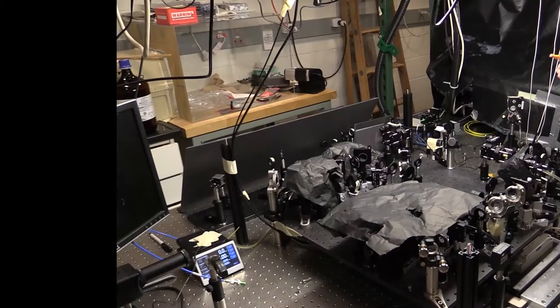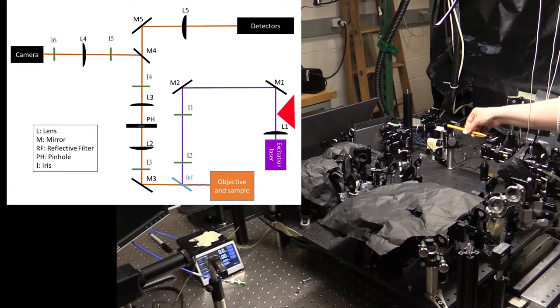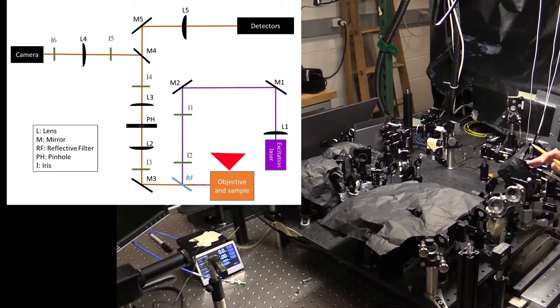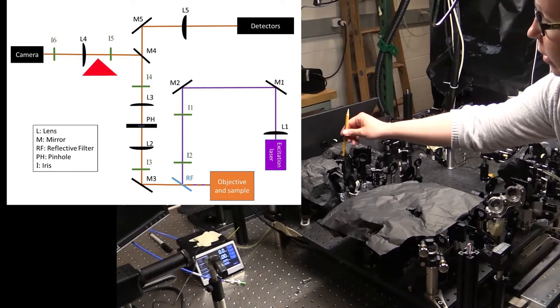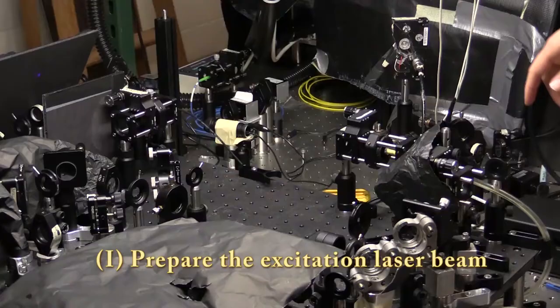In my setup, here is where my excitation laser begins. The beam path goes along here through two alignment mirrors and then continues along this path to my sample and my objective. Once the sample is excited, it will emit light that then gets translated along the collection path. The collection path includes two lenses and a pinhole. Then the beam passes through two useful mirrors and then a mirror and a lens, getting all the way to my alignment camera.